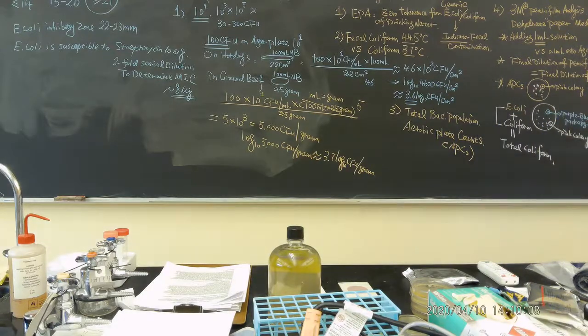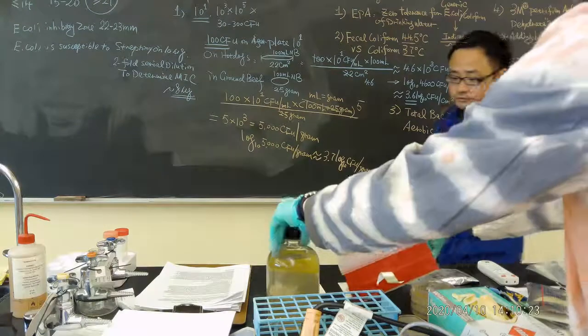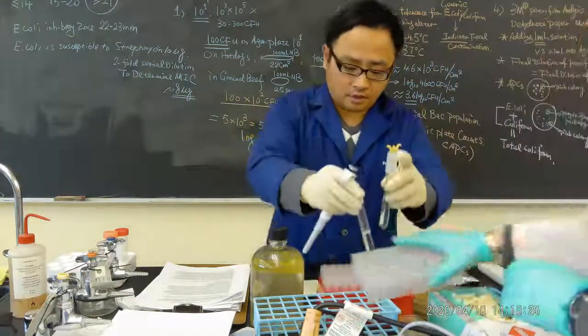Let's give an example of 2 dilution cubes. And I want a 1 ml. Can I have a 1 ml pipette? And also the pipettes, the box in the middle. Yeah. Now, yes, thank you.